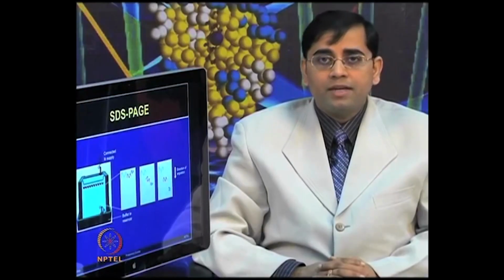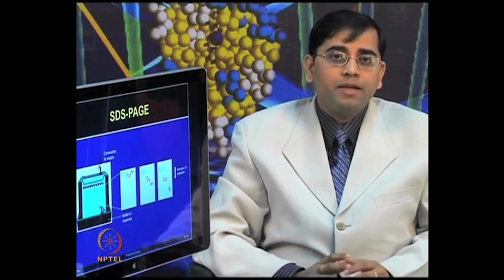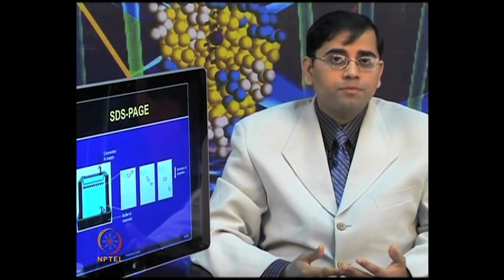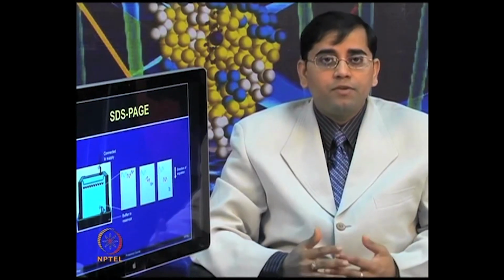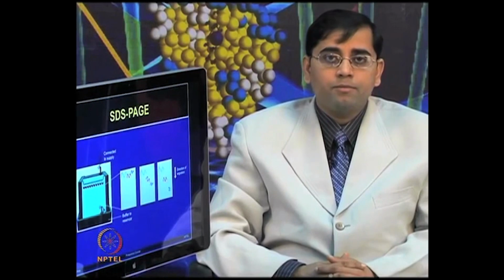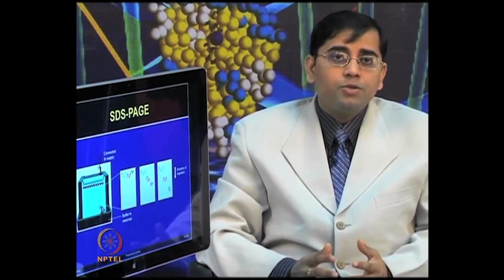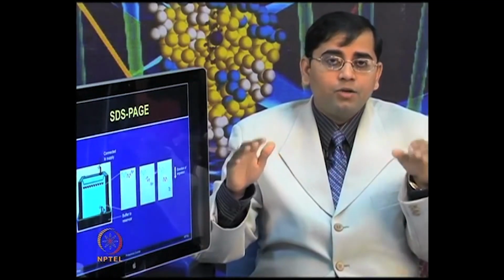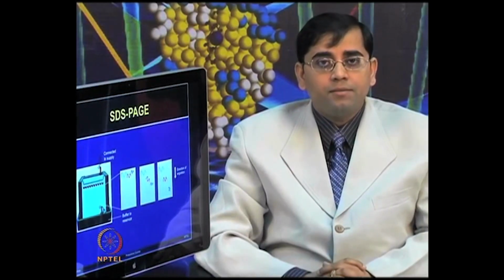I think it is important to clarify that in 2DE, when you use SDS PAGE, you do not need to make these wells by adding a comb, because you already have a flat IPG strip which has done the first dimension protein separation. So, in this case, you need to make a flat well, so that your IPG strip can be placed on top of the SDS PAGE gel.